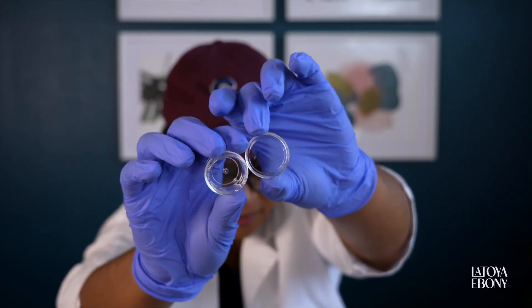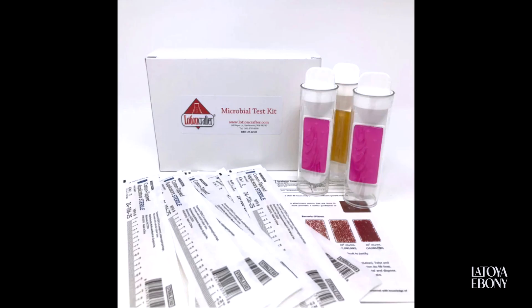I got a little pack of teeny tiny sample jars — there are 25 clear jars and I plan on using these to test lip balms. And last but certainly not least, I got some microbial testing kits. I'm so excited about this — I've never been so excited to get my incubator in my life. This is the final piece; there are 10 in a pack.